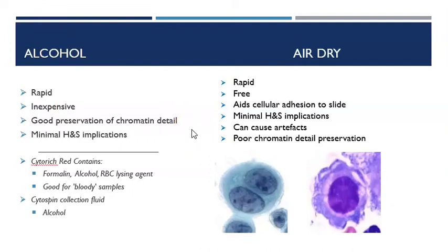Whereas for a quick dirty prep, to have a quick look at something, air drying is possible. You can apply cells to a slide and allow them to air dry. There's no alcohol there, there's no health and safety implications, I suppose. But the problem with this is you can get artifacts.